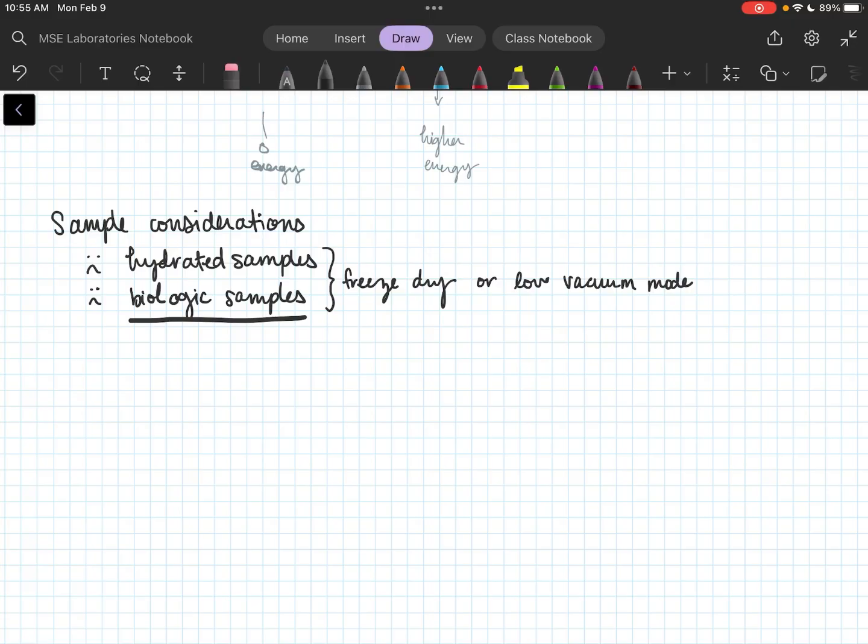Is that conductive or non-conductive? Non-conductive. And what does that do to the wood? Have you seen those artists who put really high voltage through it? Yeah, it gets all crackly, it burns the wood. It's trying desperately to find some ground, some place where electrons can flow, but it's not conductive.